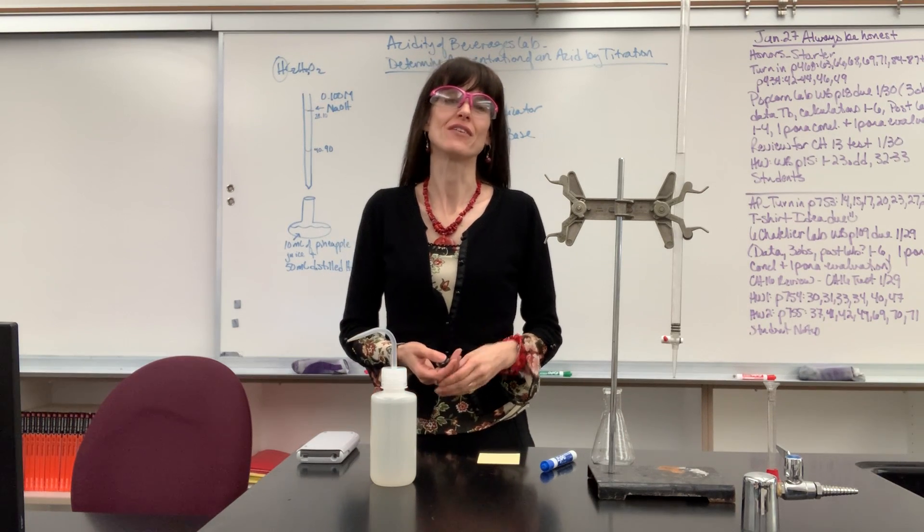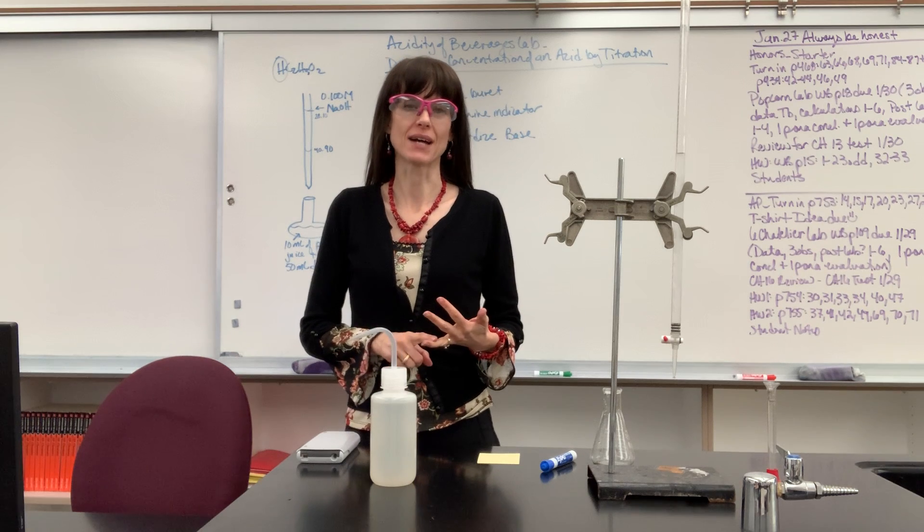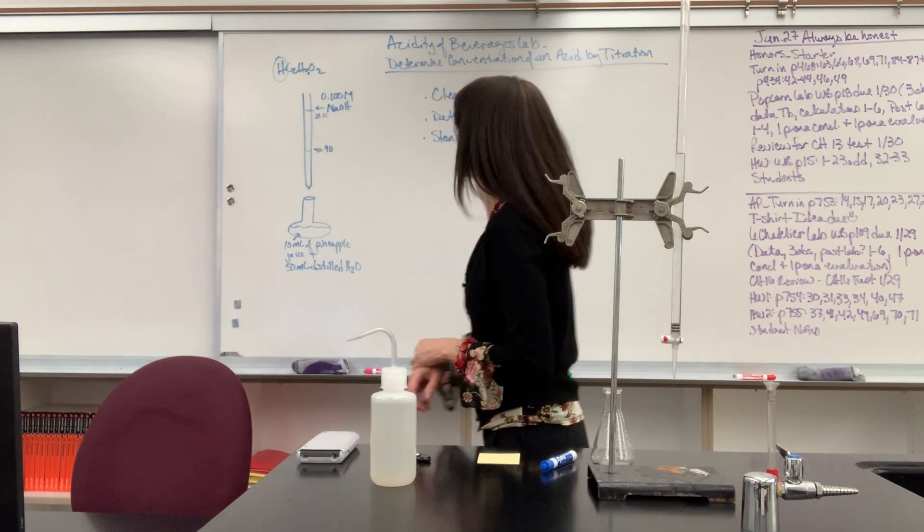Hi, I'm going to show you how to do a very common titration. It's when you have a strong base with a weak acid and you're trying to determine the molarity of the acid.